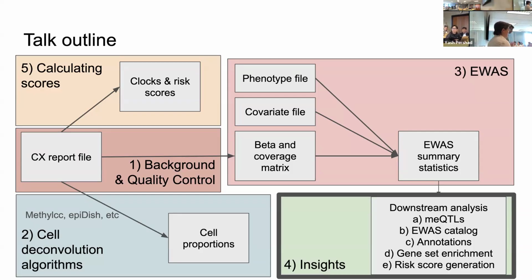Okay, sweet. So now we have our results. We have our beta values from our, let's say, we'll pretend linear models in this case, p-values, and we've done an FDR correction. And so now we have our CpG sites of interest or our regions of interest.